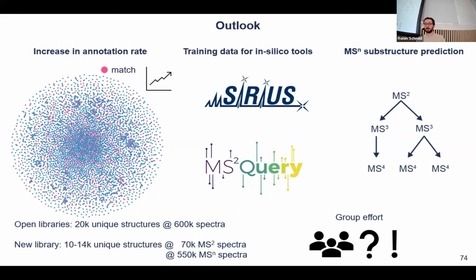But what I'm thinking is that maybe you could run an experiment where you spike in some compound with metabolomics and then see what kind of value it gives you. Because maybe if you put these into the public domain and the score is 0.4, then maybe it still has a huge value, but maybe with a special annotation.